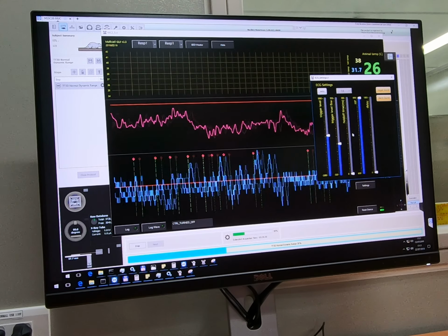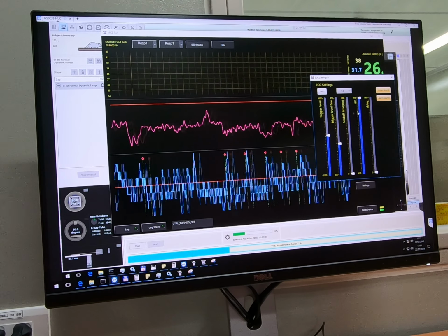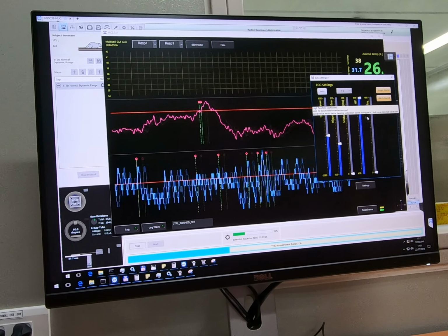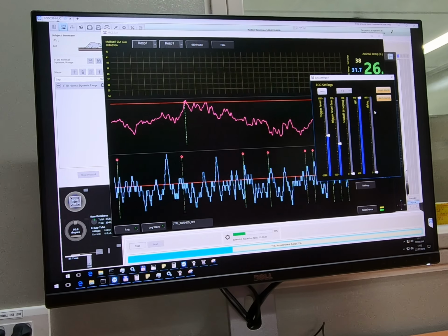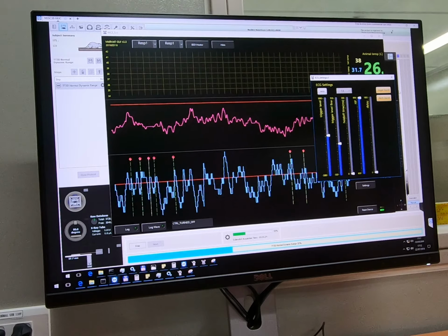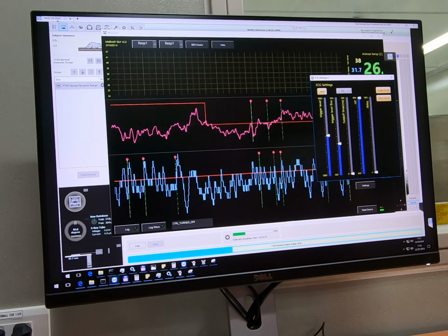So you might need to set that up. That's something we never use, and the delay is only used by the MR scans, so it's not something you will need. Yeah, let's do an automatic thresholding.